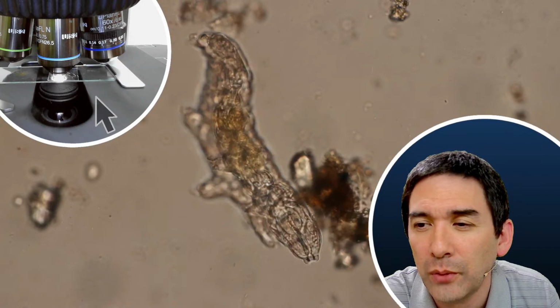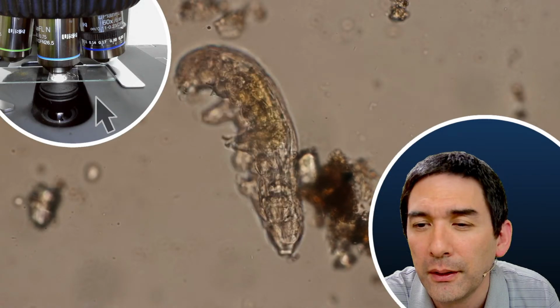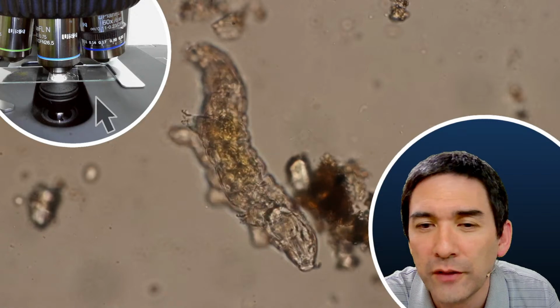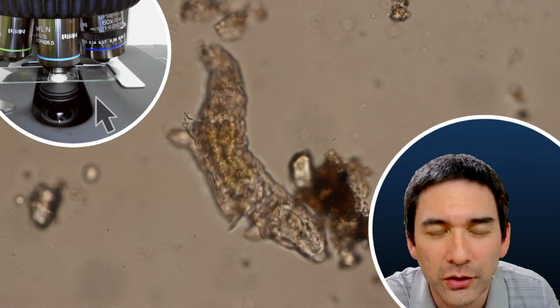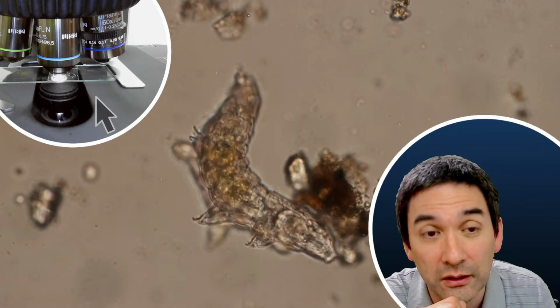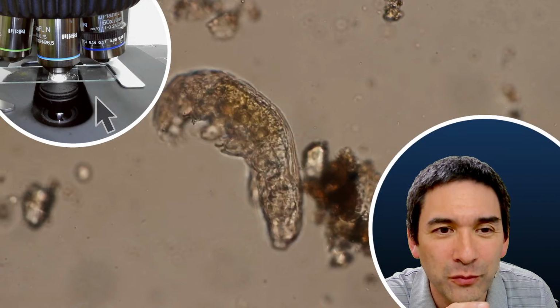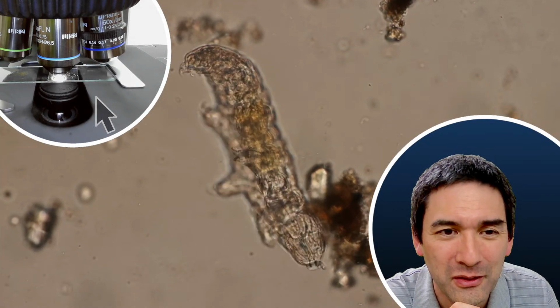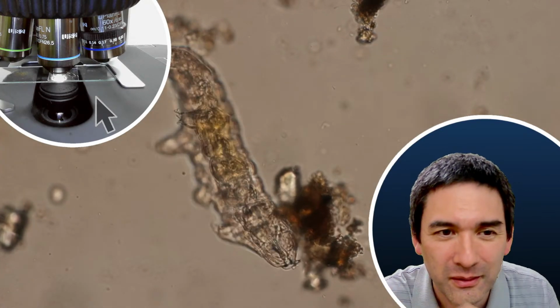Most of the dust is out of focus. I will give it one more try and move on. I'm afraid if you use too high magnification, it will be out of focus and you have to shift. Yes, that's correct. Because there is still the tardigrade, as you can see, luckily not completely crushed. And because of the fast movement, maybe you can see the claws a little bit. It's difficult to see because it's moving so quickly, but actually, at the end of the feet, there are some claws.